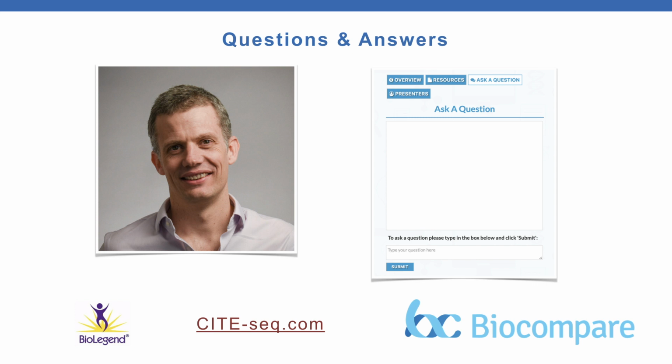Best case scenario. I think that's probably the best advice that I would have. But that's assuming that you've already tested your new antibody to show that it's specific. You've done appropriate flow cytometry controls. If you can get a cell that's knockout for that protein and show that the staining disappears, I think that's probably the best advice I can give.